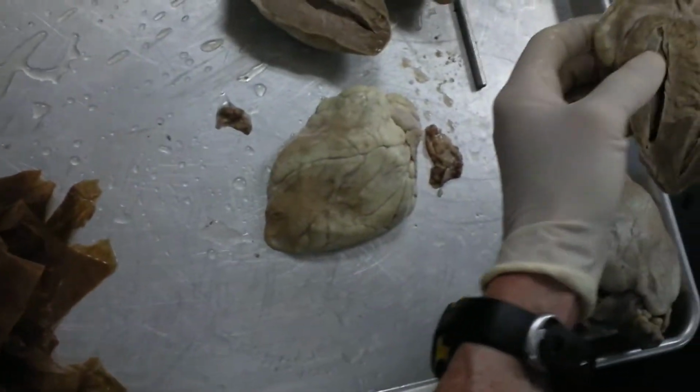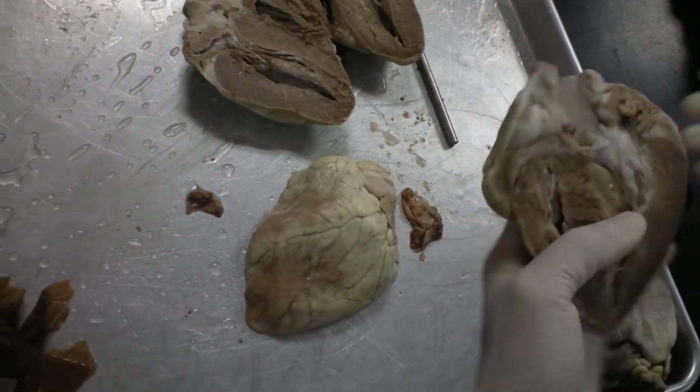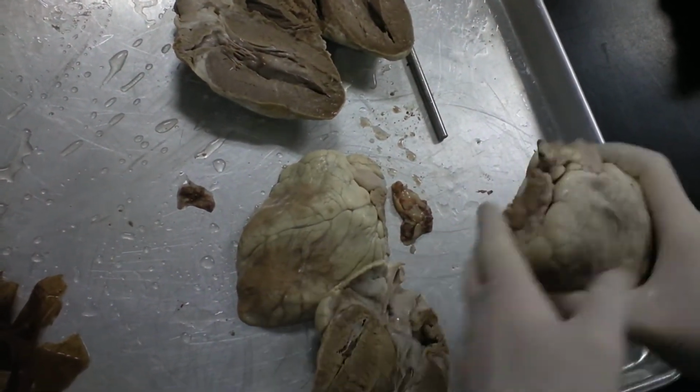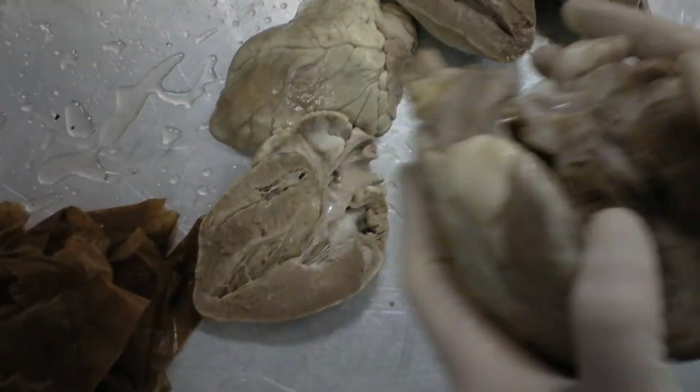There's one of these that had a good semilunar valve on it. It's snowing? No, it's not that cold. My hands are. Here's the good one. Okay, this is a different heart.